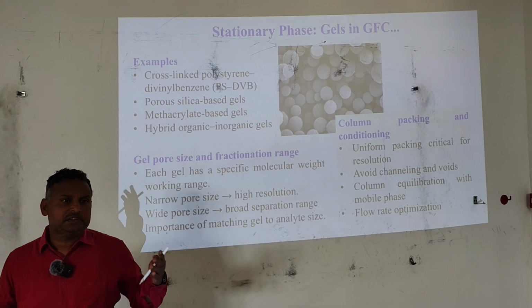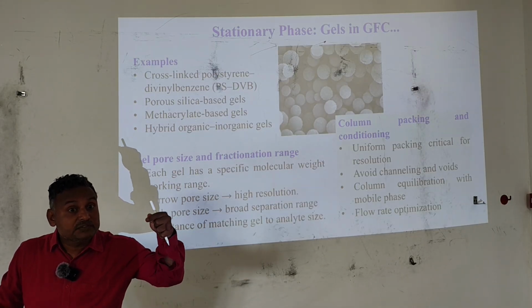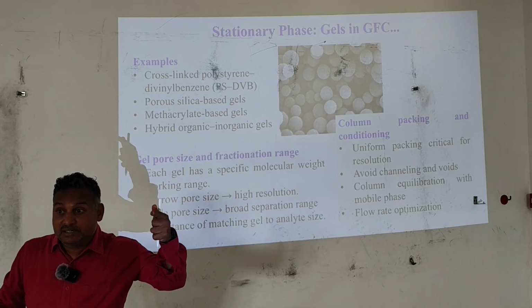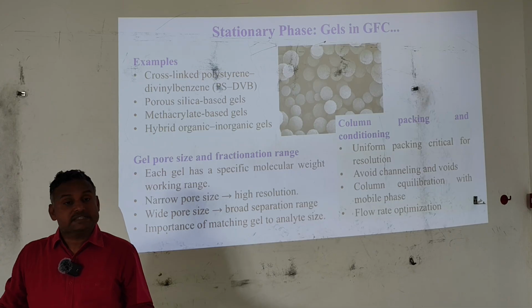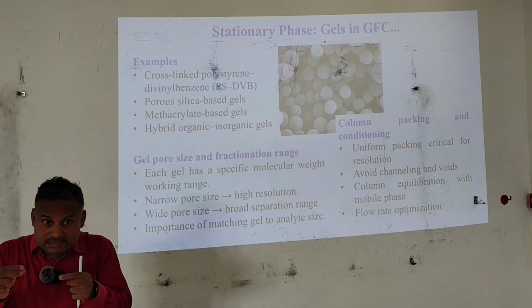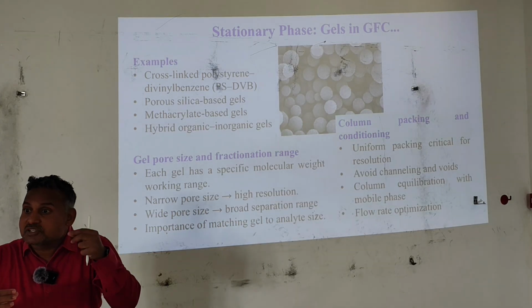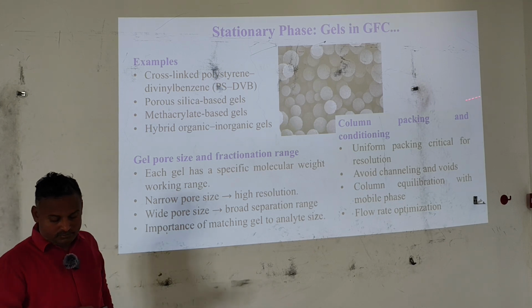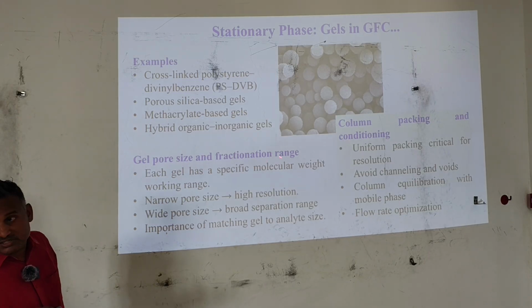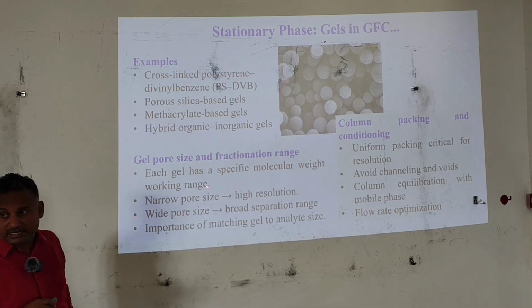That means we have different gels, and different gels also have different pore sizes. That's why the selection of the stationary phase is also very important. You need to select the stationary phase in such a way that the pore size matches the size of the molecules present in the mixture. Gel pore size and fractionation range: each gel has a specific molecular weight working range.